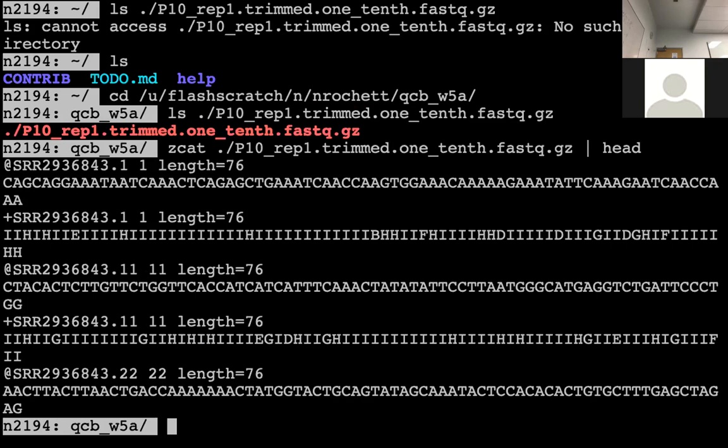Just do it first time. Just do one at a time. Or I'm not sure.